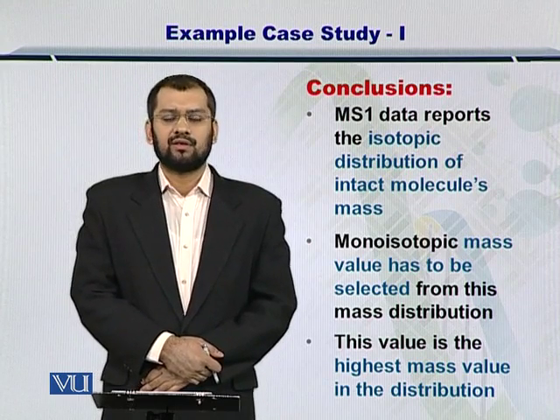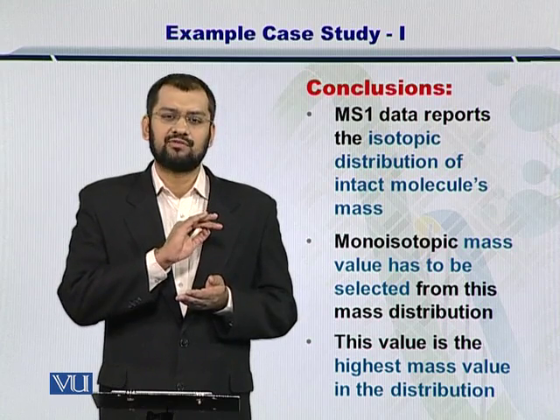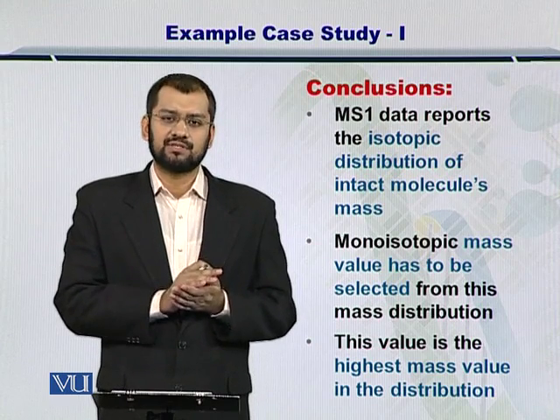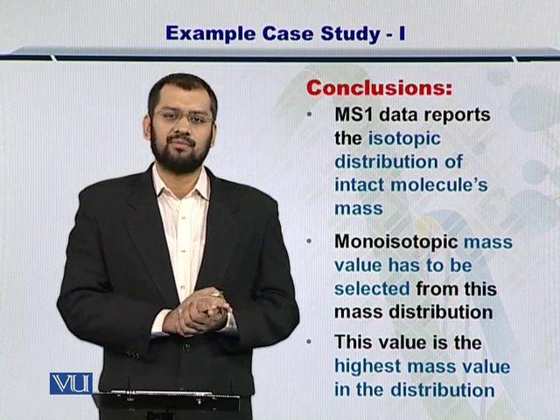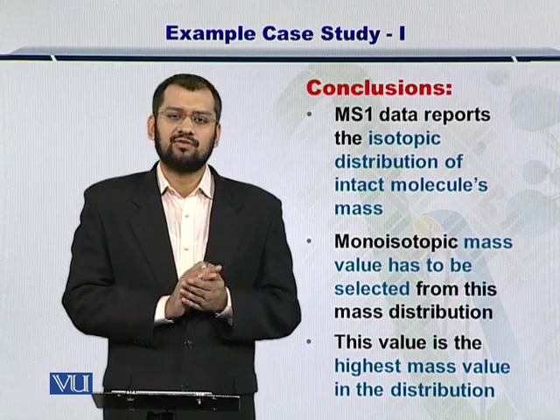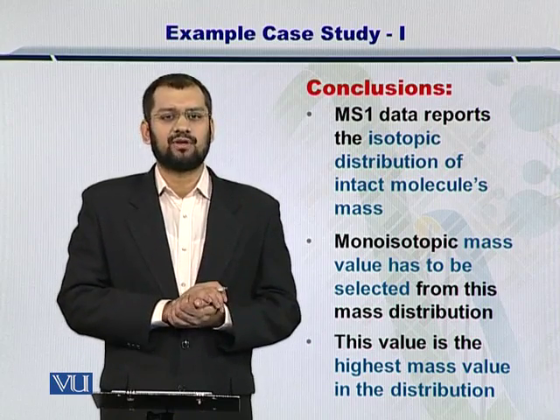The MS1 gives you an entire envelope of peaks, but using computational tools, you just select the monoisotopic peak from the peak distribution. And that is the mass of the intact protein or the peptide, and you can use it for further analysis.